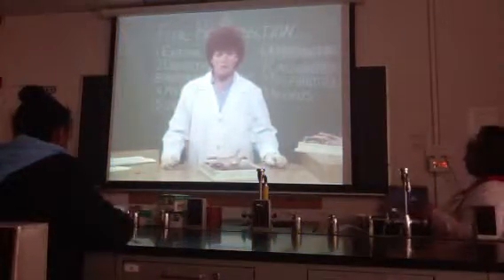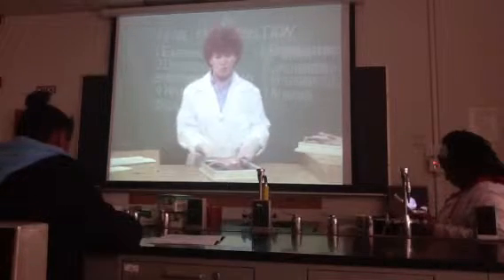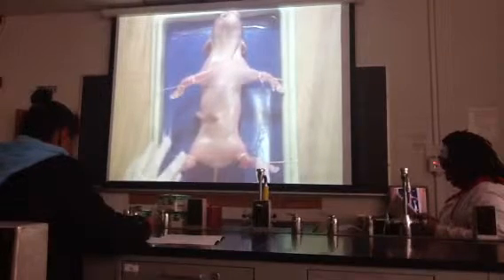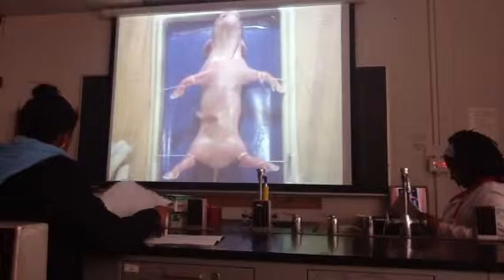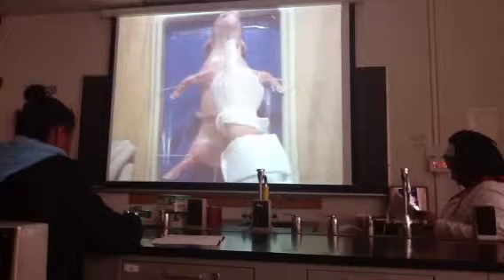We're now ready to begin our dissection of the fetal pig. Place your specimen dorsal side down in the dissecting tray. Make sure that you tie down both pairs of appendages. Once they're securely tied, we're ready to make our incisions. Start up at the base of the neck at the hairy papilla.